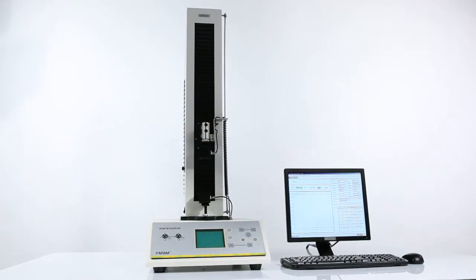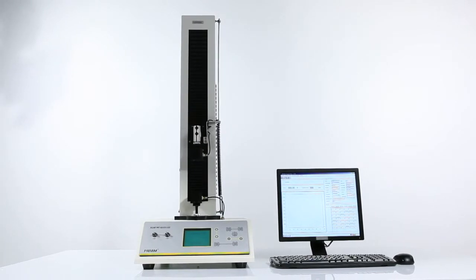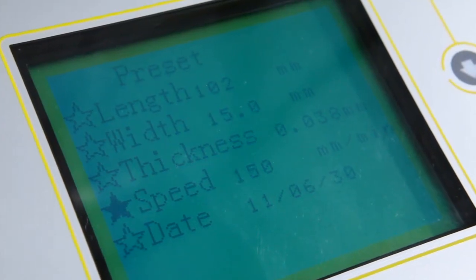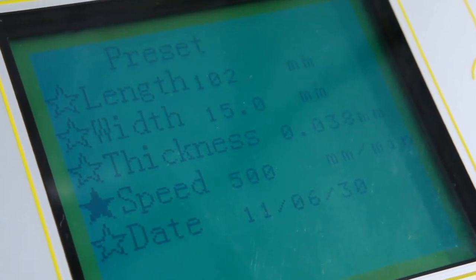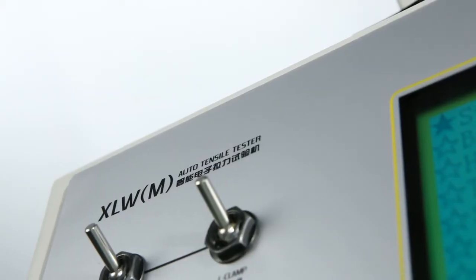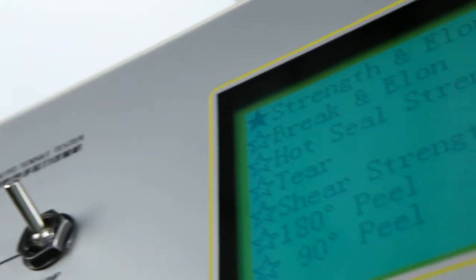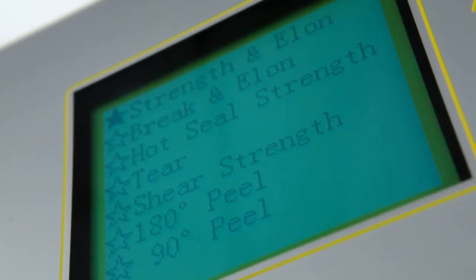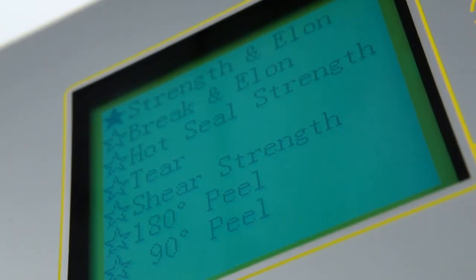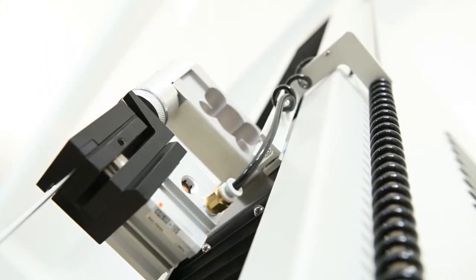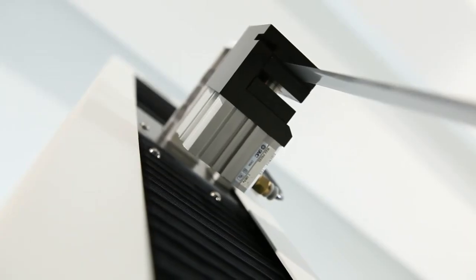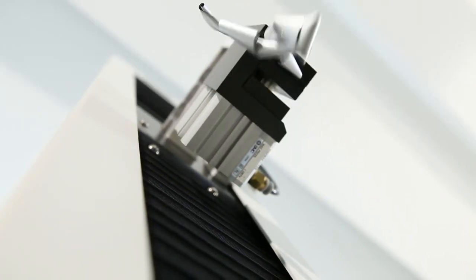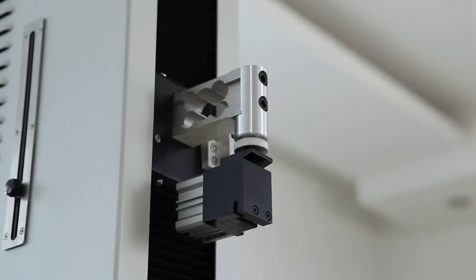XLWM is LabThink's basic automatic tensile tester. The instrument can perform tests at seven different testing speeds to meet different industry standards. It can be used to measure tensile strength, peeling force, tearing resistance, heat seal strength, and other properties of materials, and provides research institutions and manufacturers with excellent solutions for analyzing the relevant physical attributes of packaging materials.